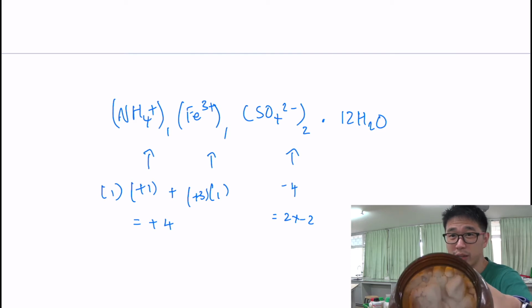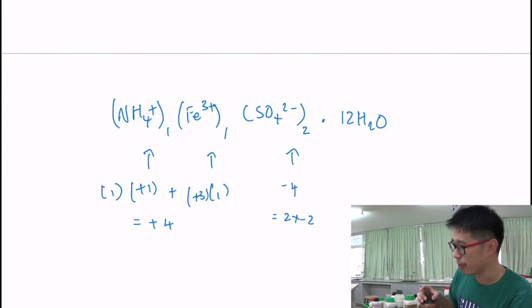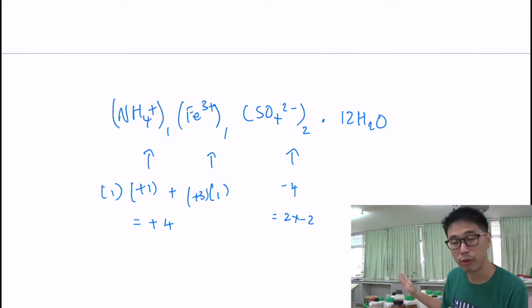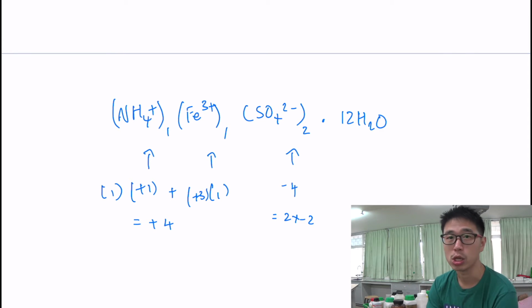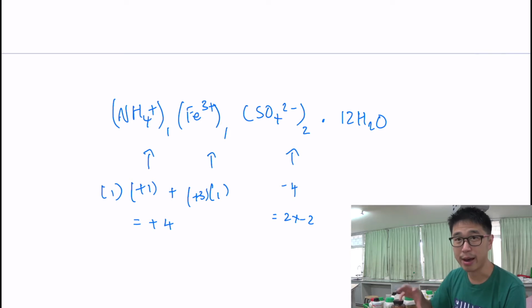It looks really whitish, and that is probably because of the color of the ammonium salts. Okay, so ammonium salts will be ionic. It has a giant ionic structure, so it's a solid at room temperature and pressure. They will always be white in color, except when they are mixed with a transition metal compound, such as this double salt.